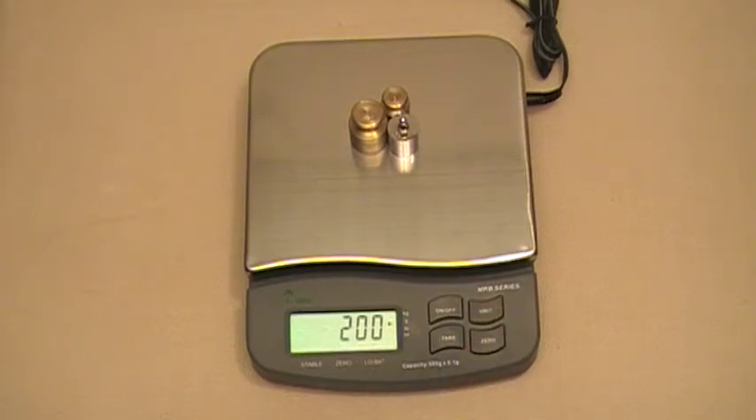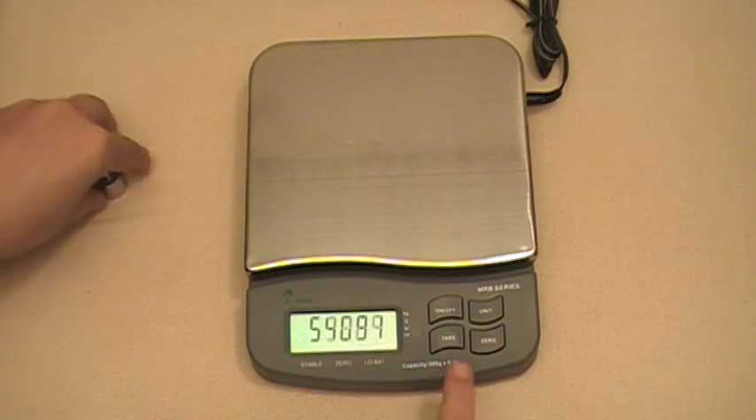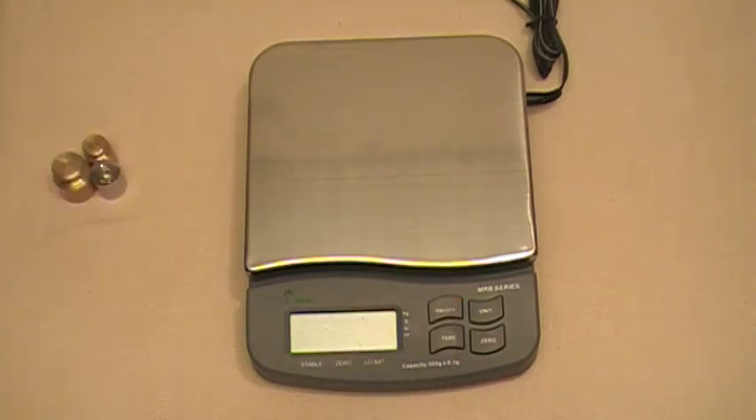Wait a few seconds and it'll say zero, zero, save again. Once it does, it goes back to the AD value. Take your weights off, press the off button, and the setting is saved. Thank you.